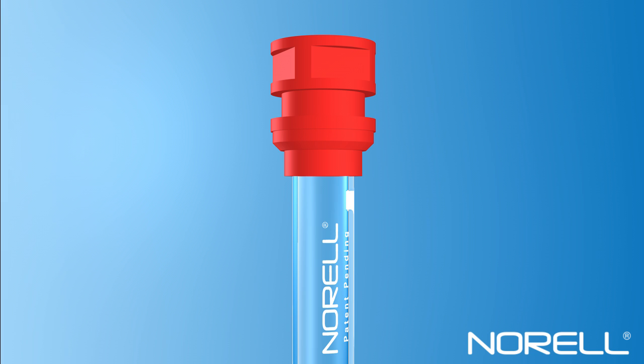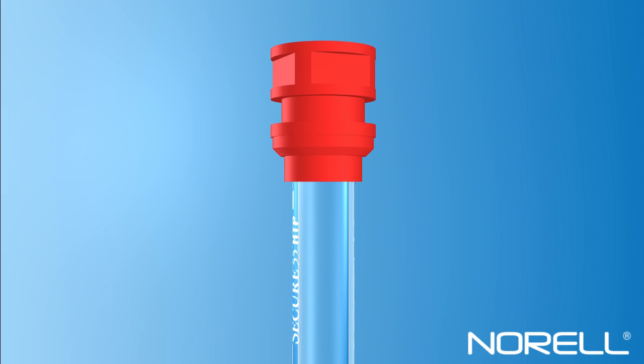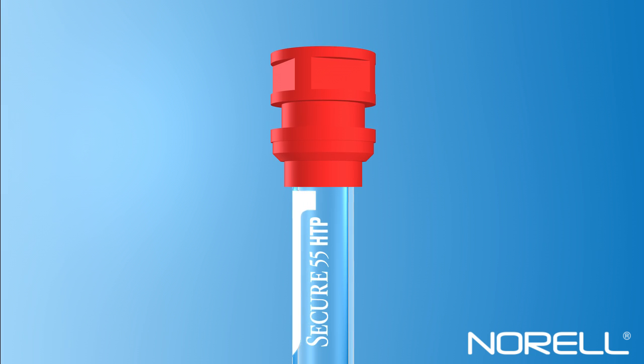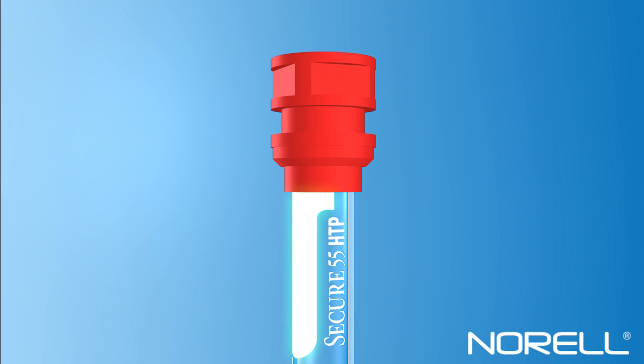The Secure Series NMR sample tube also uses a marking or label area that also functions as a clear visual indicator, defining the limit for full and complete closure with the Norlock 2 security cap.